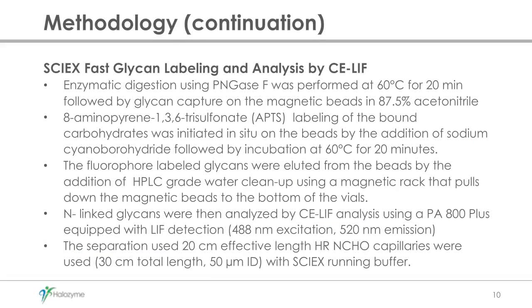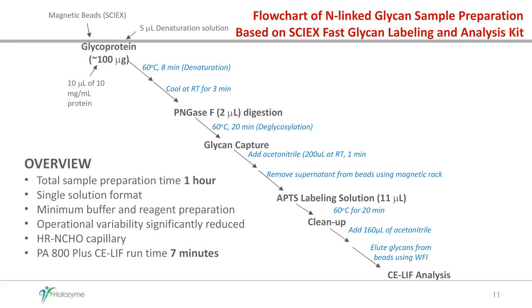Okay, so now I'm going to move into the SCIEX kit that we currently started evaluating at Halozyme. Just keep in mind, all of these are fluorescently labeled, so of course you would need to have your fluorescence detector.